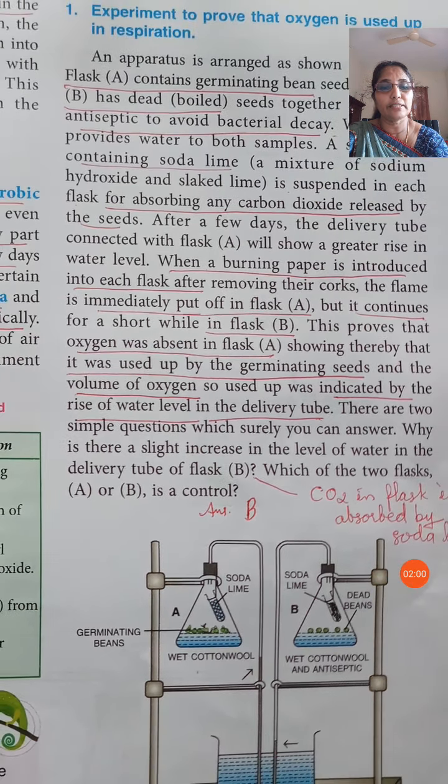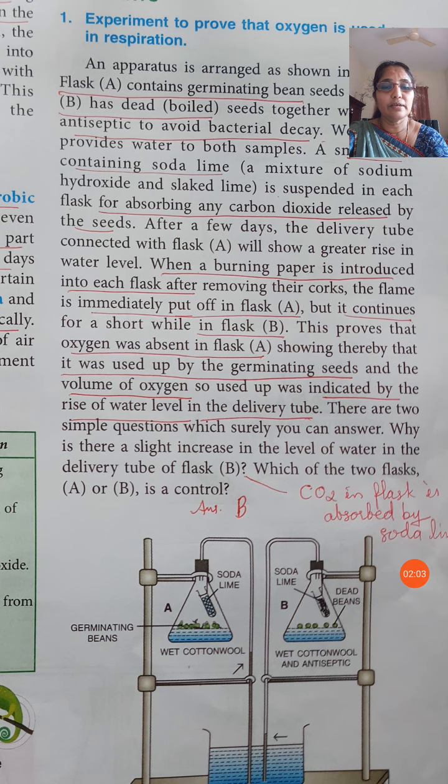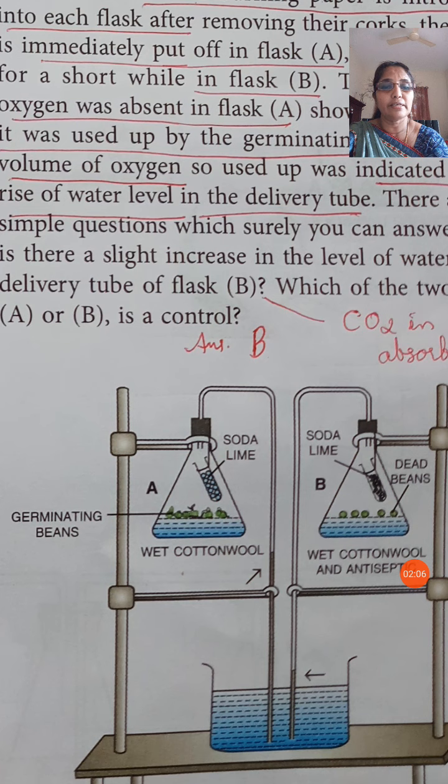After 2 or 3 days, we can see that there is a considerable rise in the tube that is connected with flask A. The colored water from the beaker rises up to a level. We can see the rise of water in the delivery tube.